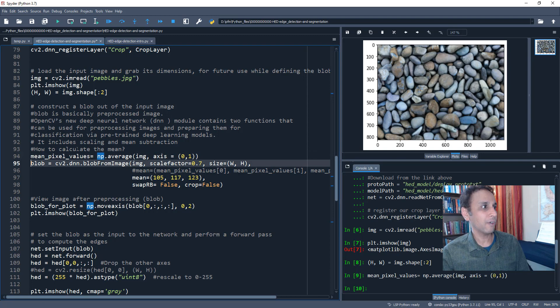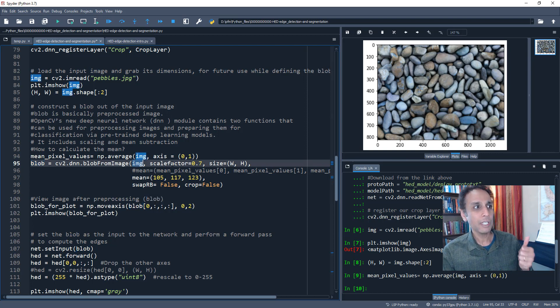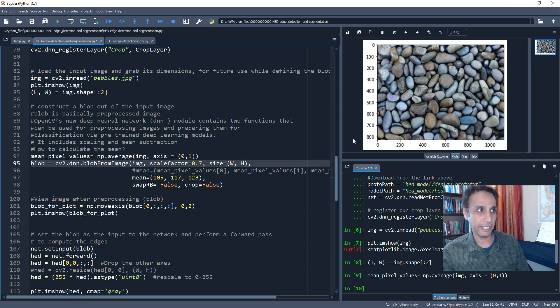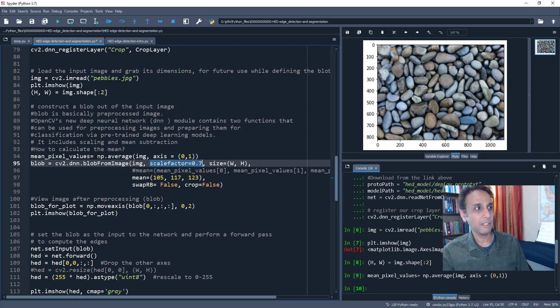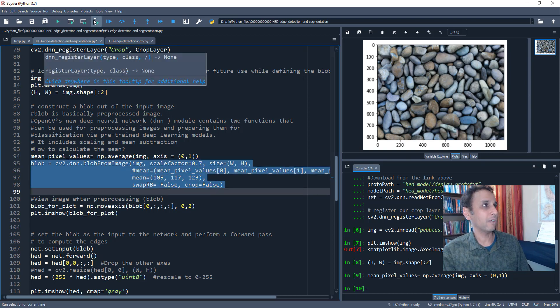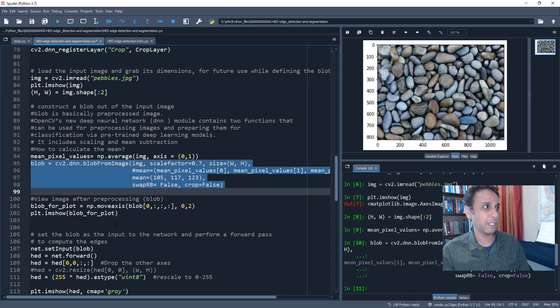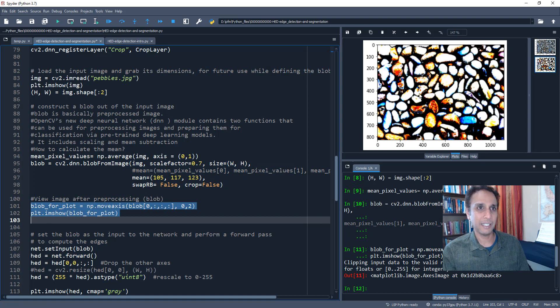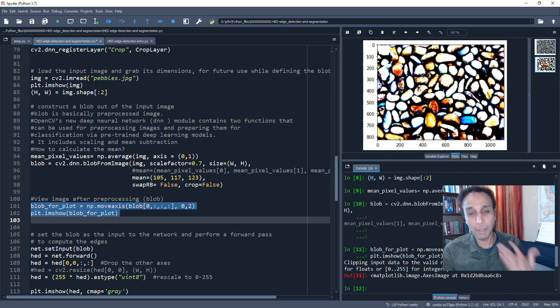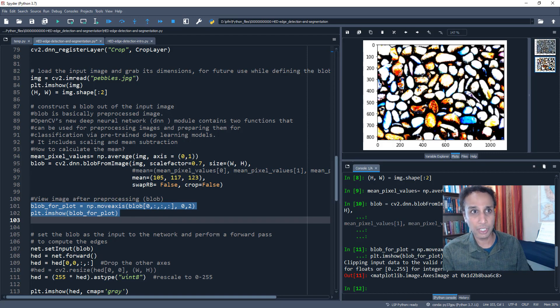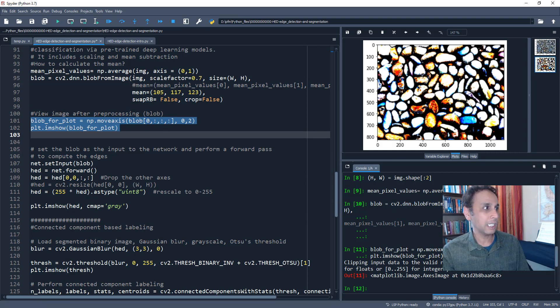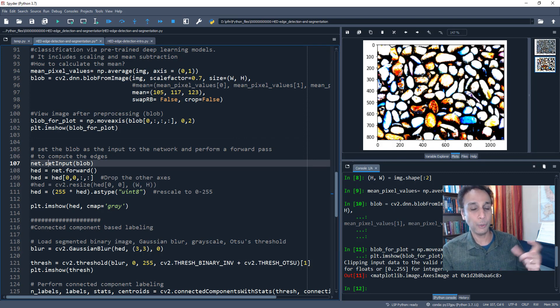So you can enter them down here. I did initially calculate the mean and added the values and then I modified it a little bit to get the desired result I'm looking for on the screen. So that's why you see the mean values here to be hard coded. So I don't need to run this line, but let's go ahead and run it for the fun of it. And now let's do the blob from image stuff. So it requires your raw image. Scale factor. Again, this is something that you can change. You need to change to make sure that you're getting the desired result when you're doing edge detection. So the two things that you need to play with are scale factor and mean. Okay. So let's run this blob. So it creates a blob of our image, which is basically a preprocessed image. And if you want to see how that looks like, it looks like this. Yeah. So this is our original image and this is the blob right there. Sorry, I mean blob, but this is basically the preprocessed image. Okay. Original preprocessed image.